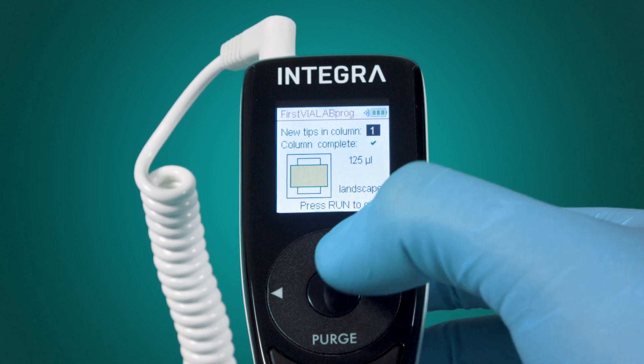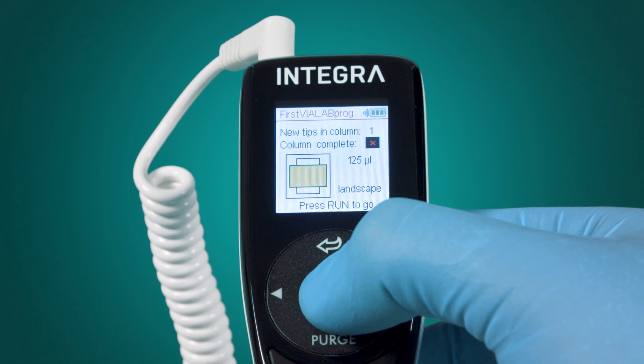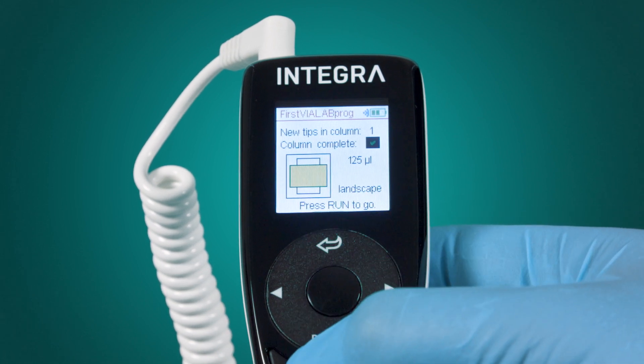The instrument remembers which tips were taken in the previous run, and the tip position will be automatically set to the next available tips.